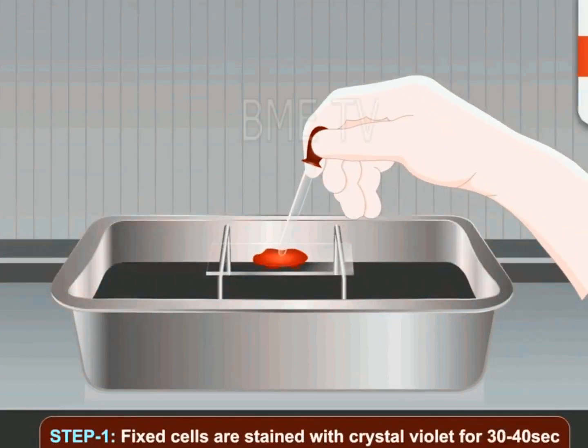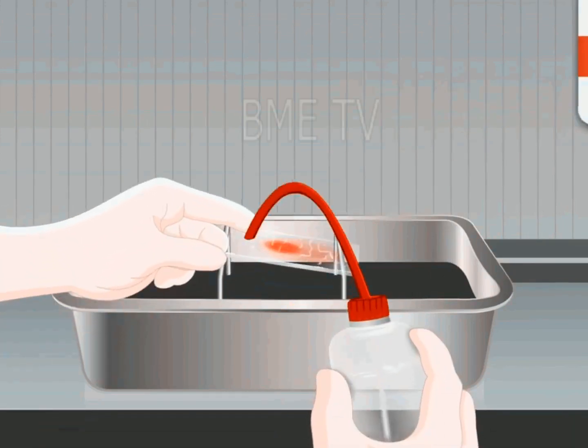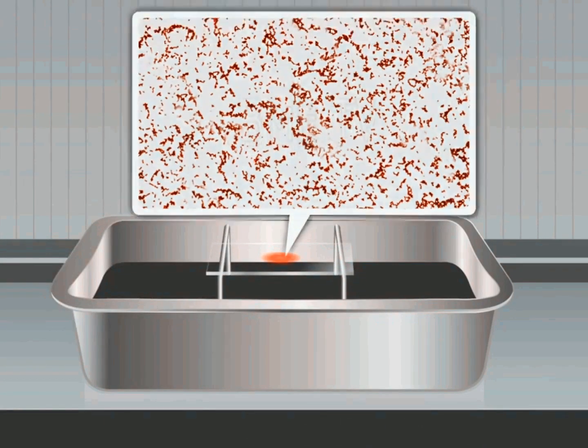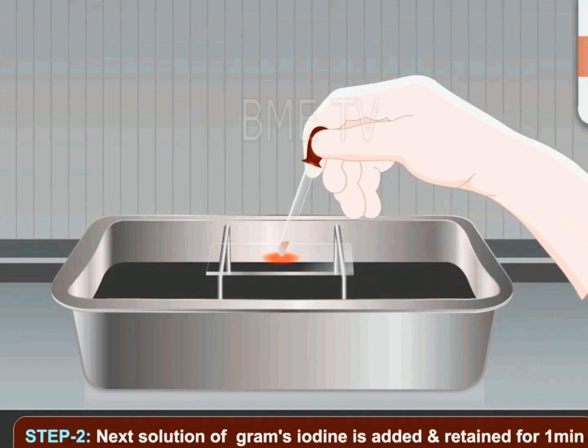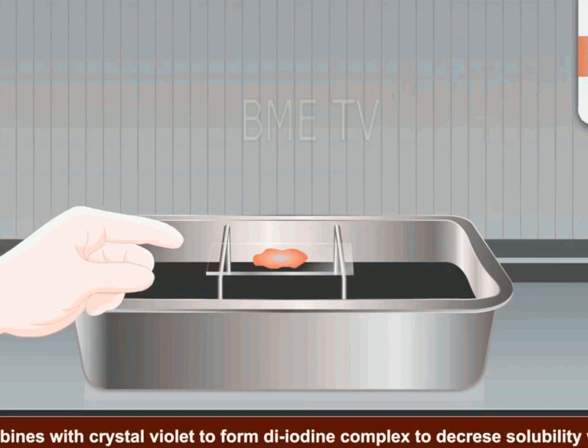Microbiology is the least automated of the disciplines in the clinical laboratory. Several procedures in microbiology lend themselves to mechanization, but little has been achieved. A gram staining apparatus, the Shandon-Elliott slide staining machine, has been developed but has not been widely distributed. We describe here a machine which simply and reliably automates the gram staining procedure.